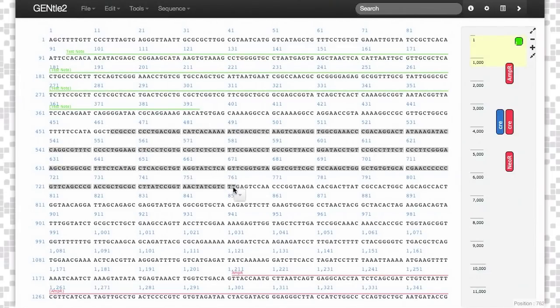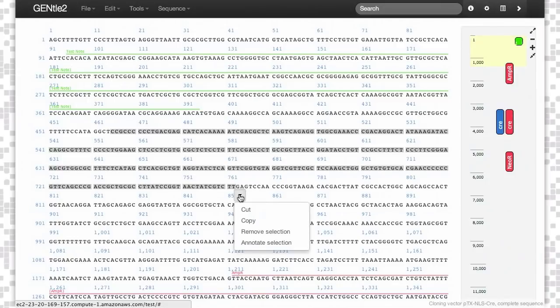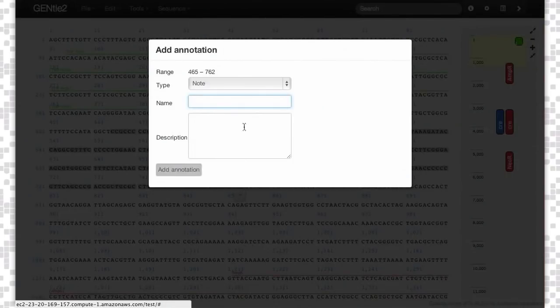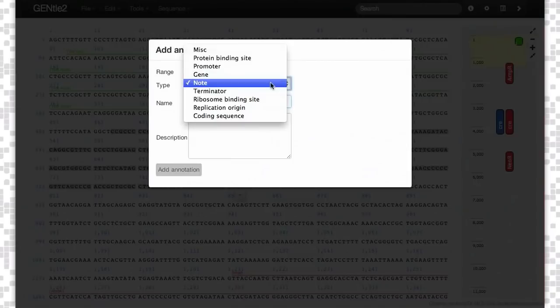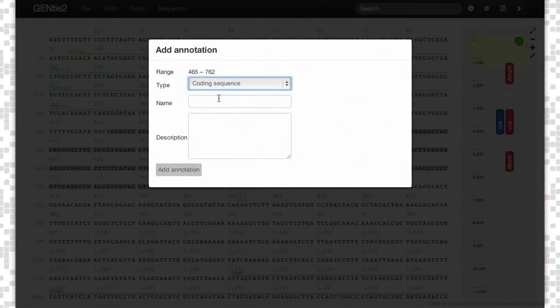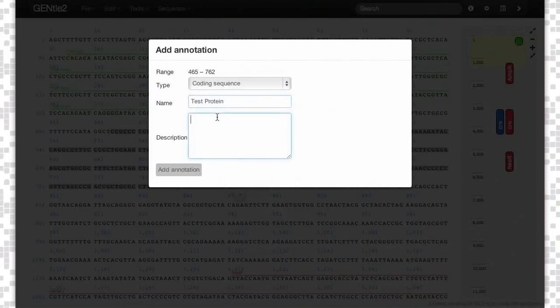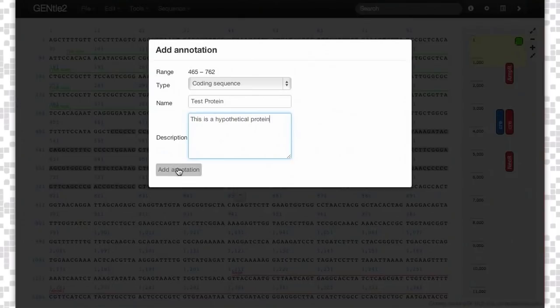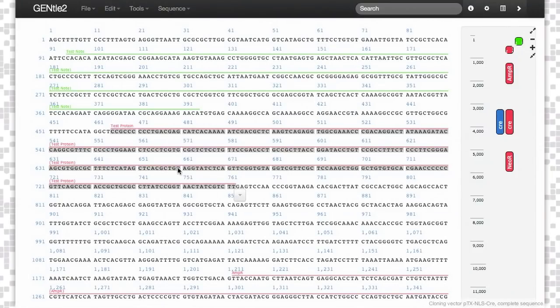Drop down, if it is a sequence that codes for a protein, and you're done.